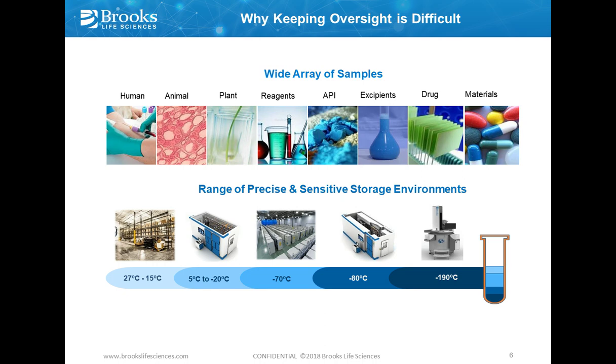So I want to ask this question: why is it so difficult to keep track of samples? One of the foundational things that goes into answering this is the wide array of different sample types that there are. What you see here is a list of very high-level sample types that people have in association with a clinical trial. Within any one of these, you can have lots of variation. For human samples, for example, you can have blood derivatives and many other matrices that you need to store information on. And the key information associated with each of these samples can vary based on the sample type as well as the disease that's being studied.